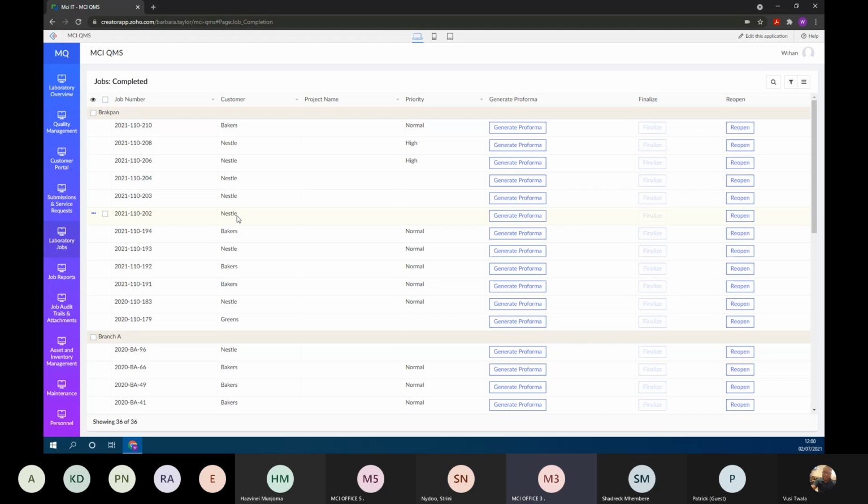It's two things. It's to generate a costing. Now that is something we can switch on and off depending on the customer. So for instance, take a manufacturing environment. So let's say the laboratory is not a commercial testing entity. It's just an in-house department, and they just do quality control on their own products. So on the laboratory's books, it's an expense department. It doesn't generate revenue, so they have no interest in invoicing. They have no one to invoice, and they're certainly not going to invoice themselves. So they may not need the pro forma function. So we would disable that.